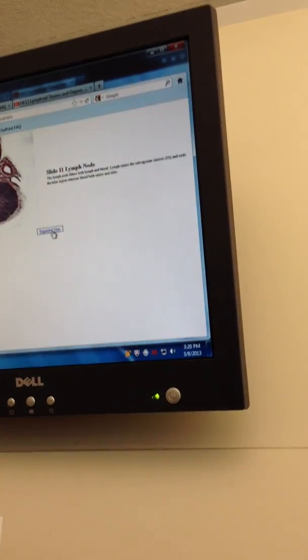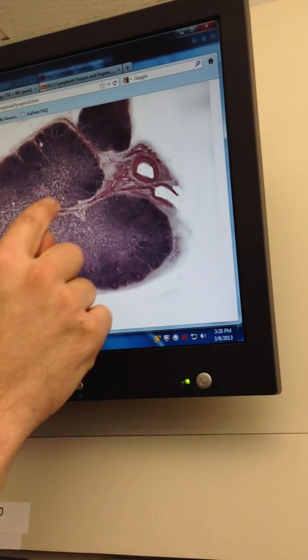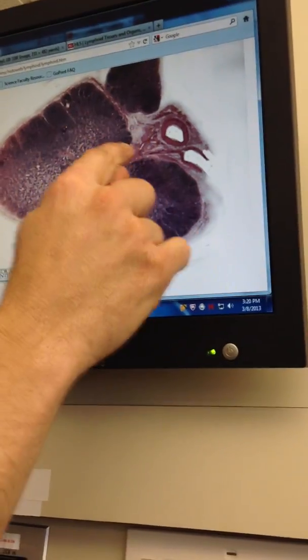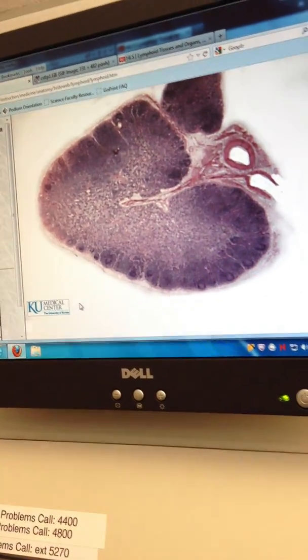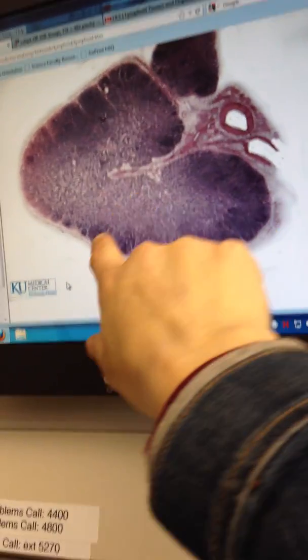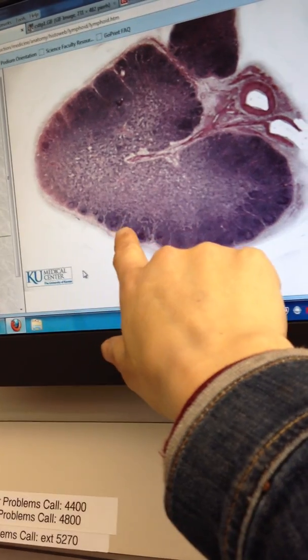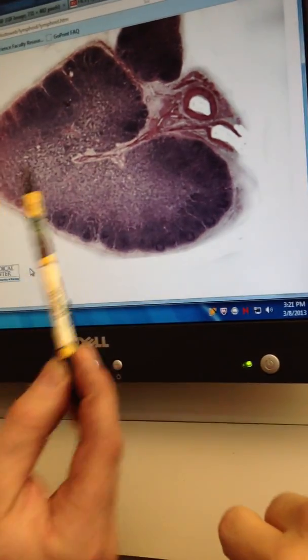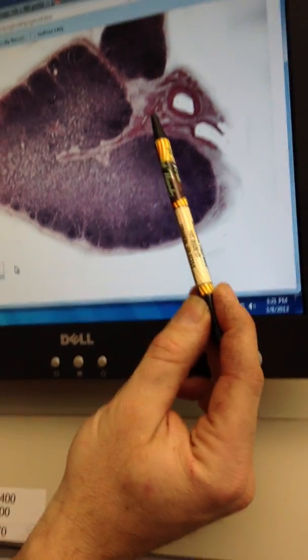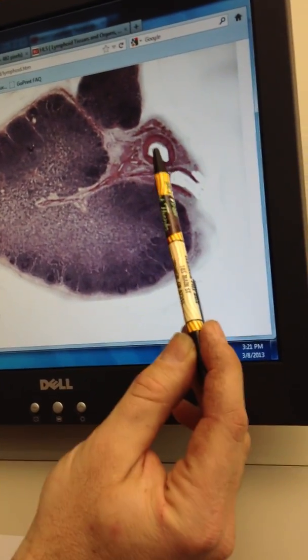So this would be your sinus here, this big space, and the little dimple is called a hilum or hilus, like the kidney having a notch. It's like a kidney, right. So these are cords. Yes, these are trabeculae, cords, or sinuses. So sinus would be basically from here to somewhere, wherever, that doesn't count really officially.